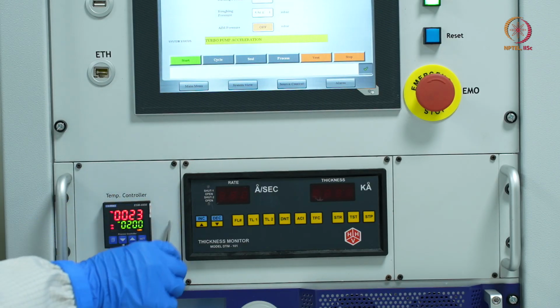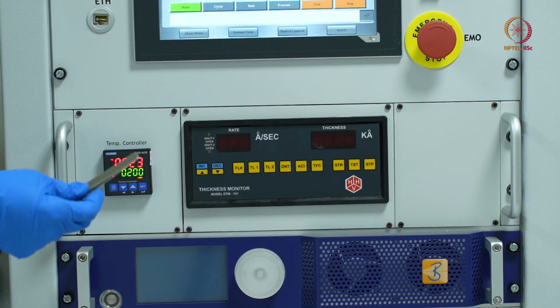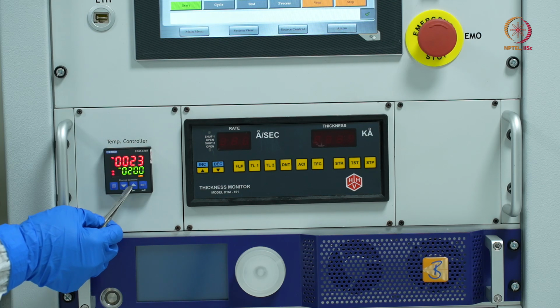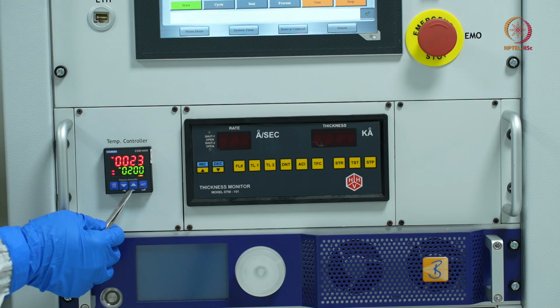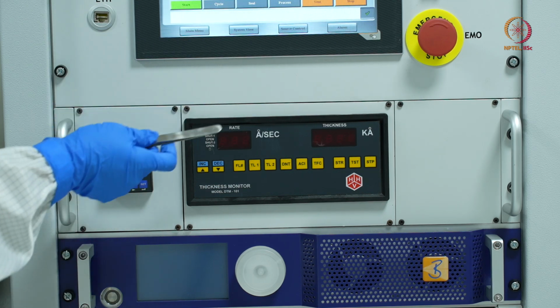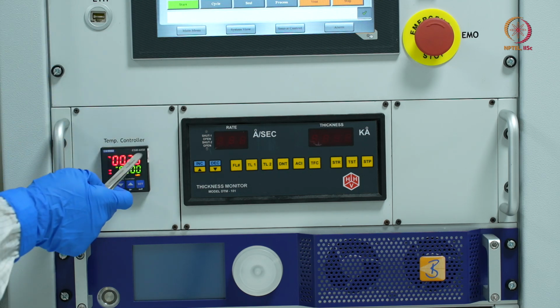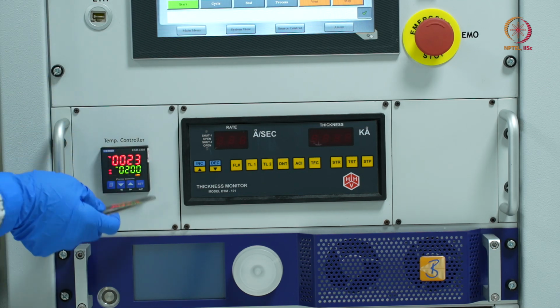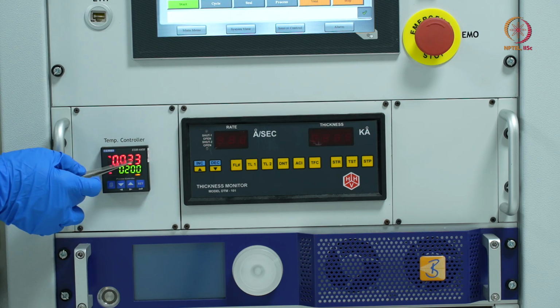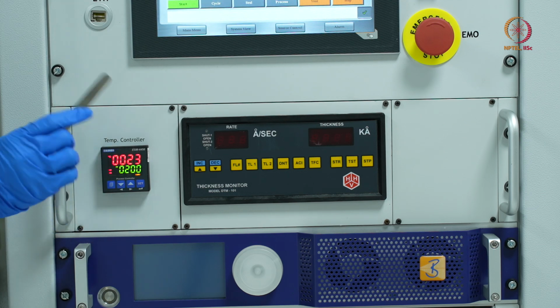This panel is the temperature control, wherein if you want to increase the substrate temperature, then you can set the temperature and decrease or increase the temperature using these buttons. And once you enable it from the display panel, the substrate will start heating, and it will reach the set value, which is displayed here in green, and what is displayed here in red is the actual temperature of the chamber.